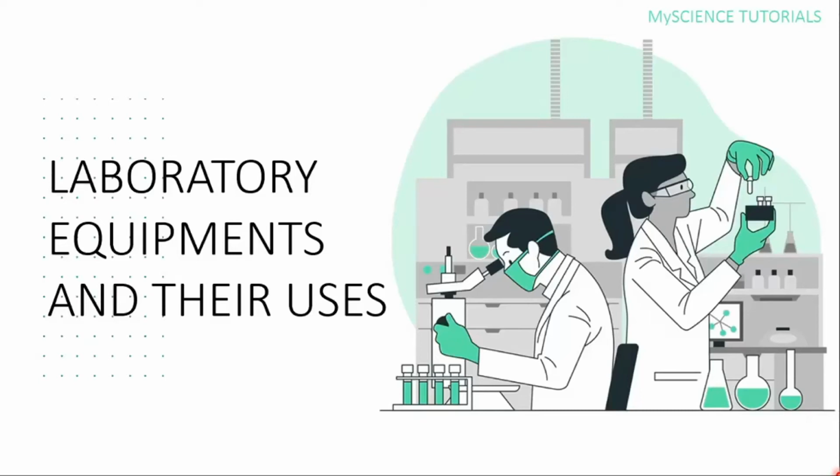Hello and welcome to my science tutorials. In today's video, we are going to be talking about laboratory equipment and their uses.